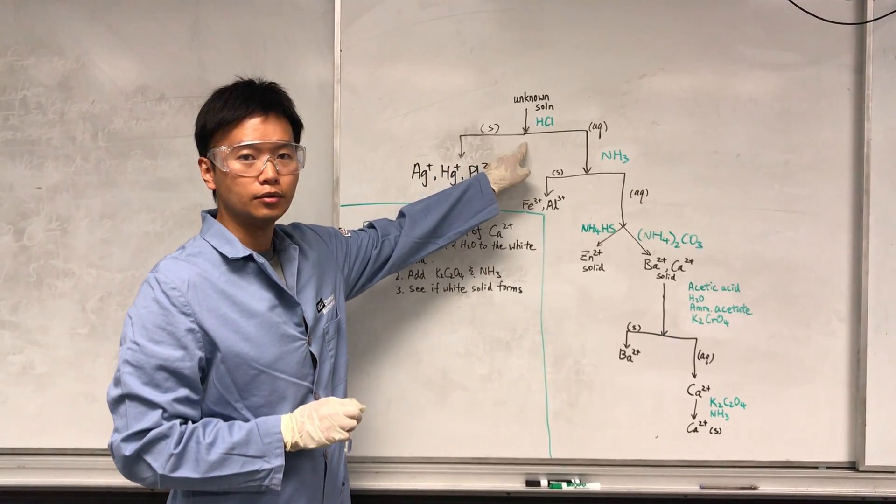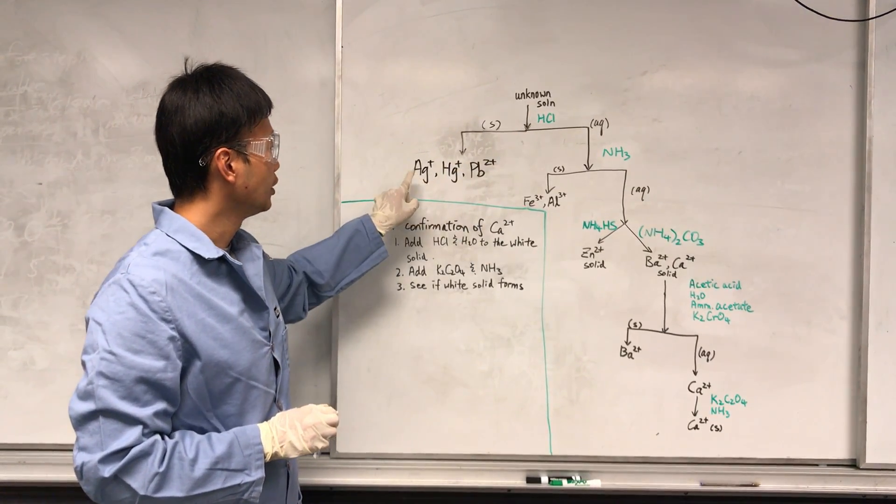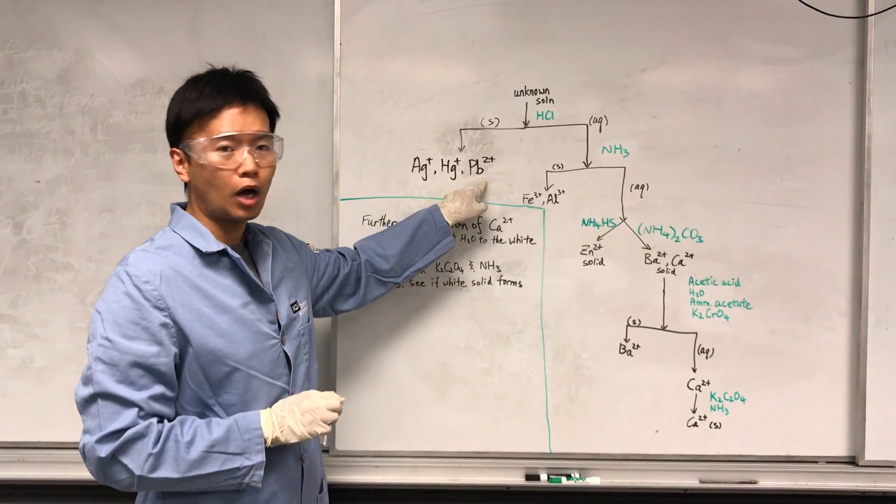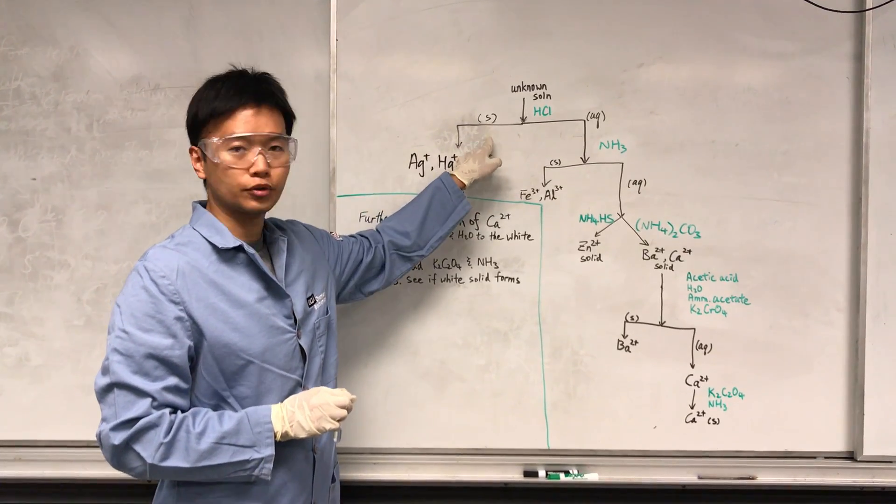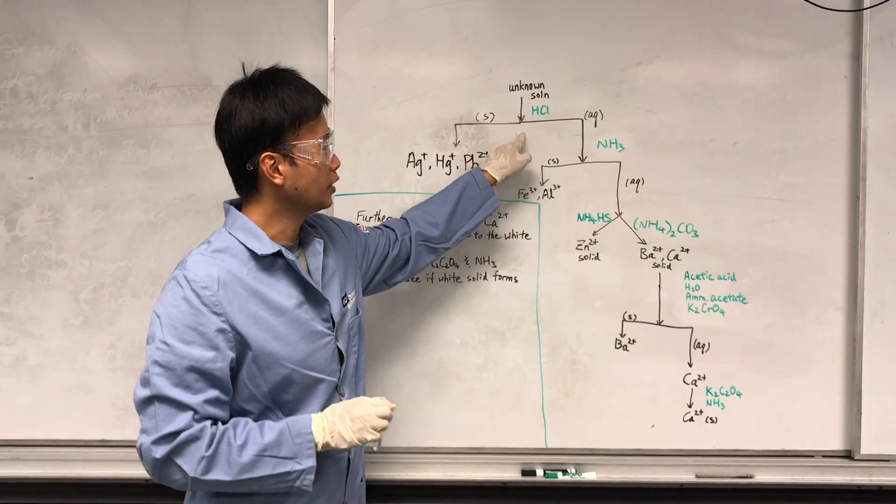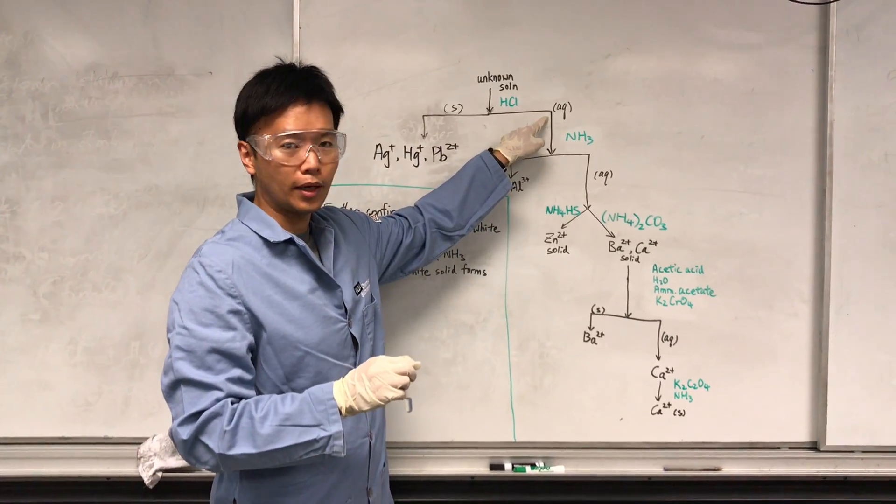So the first step is to add HCl, and if I have any silver metal cation in solution, then it will first precipitate. If not, then the silver will remain in solution.